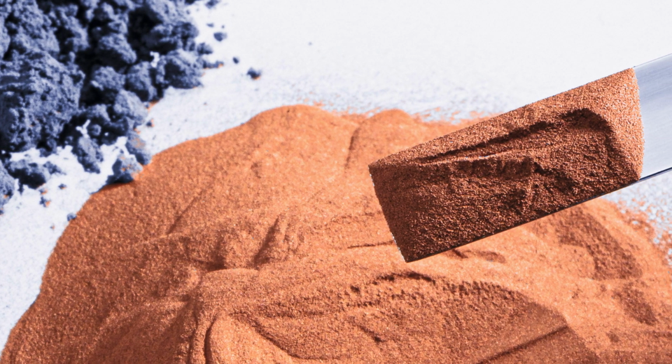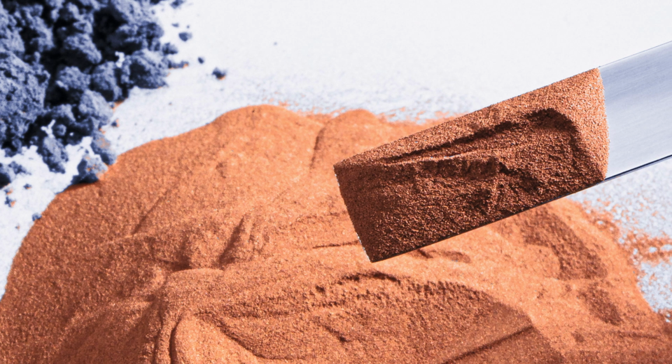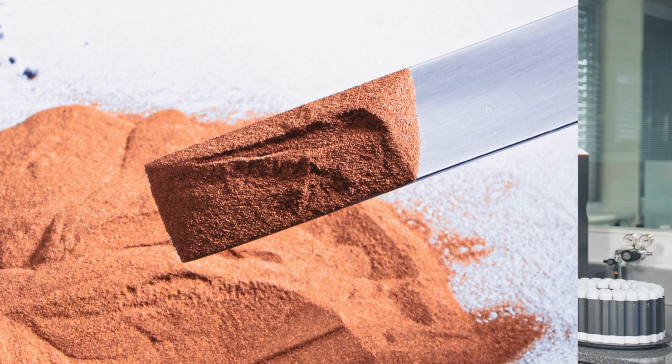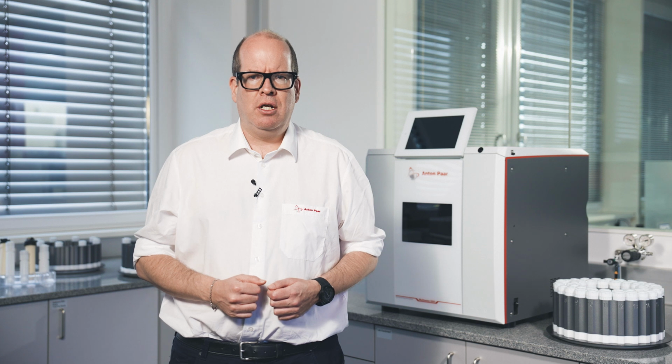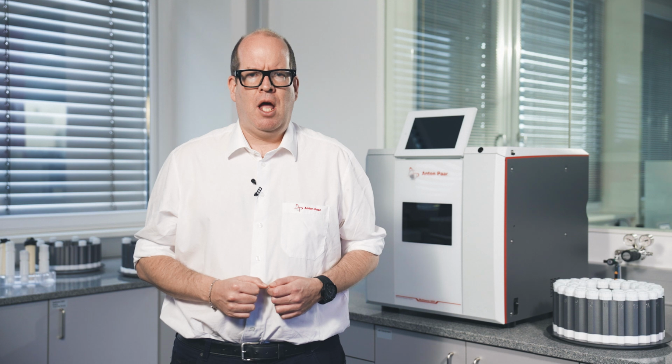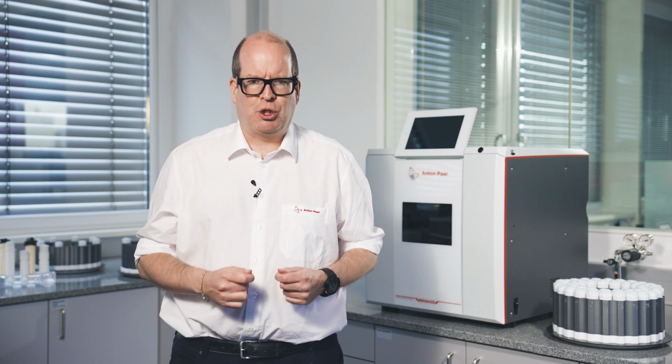By the way, if you have solid samples, make sure the particle size is as small as possible, since powders are easier to digest than granules or pellets. But even if you use fine powders and the optimal acid mixture, you won't be able to digest your sample if you don't heat the whole mixture. A second factor that's crucial for digestions is temperature.